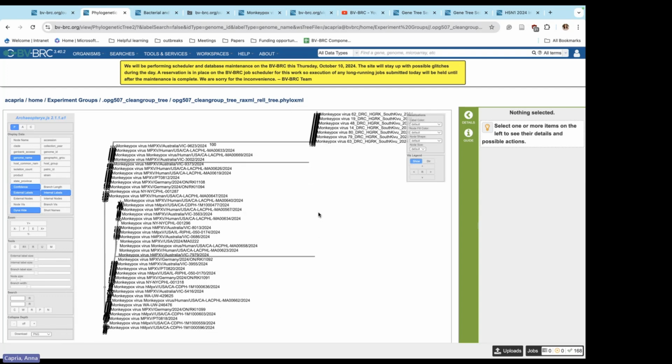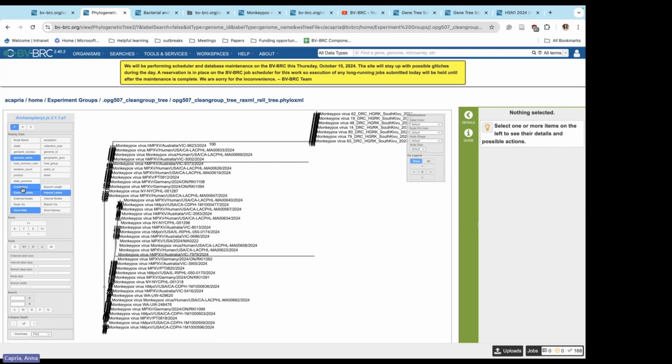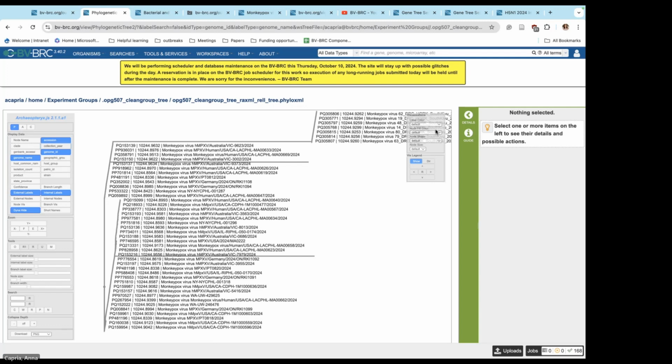You can see that this gets a little bit more clear. There's still some that need to be looked at further, but very similar sequences across. So if you pull the names away, then you can quickly see what adding or taking away those facets, like Christian was mentioning, and label different colors.